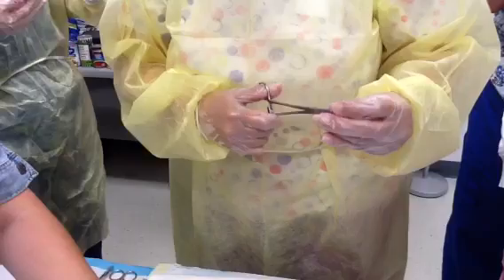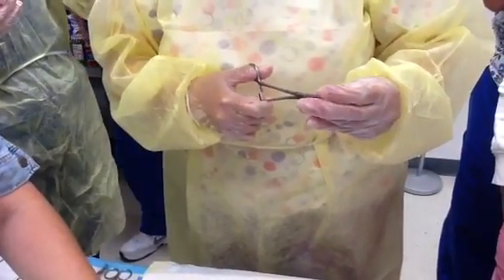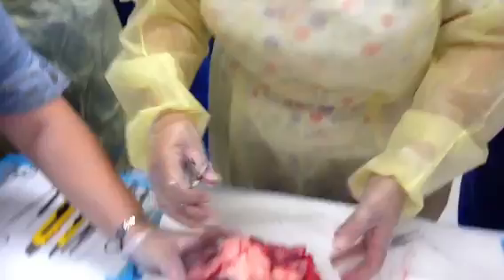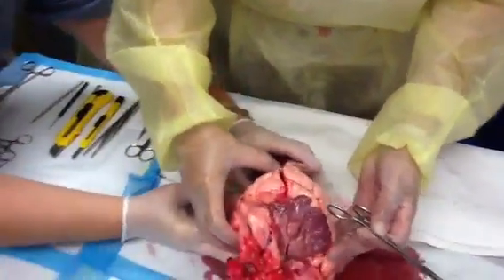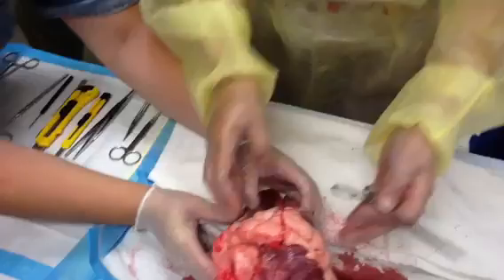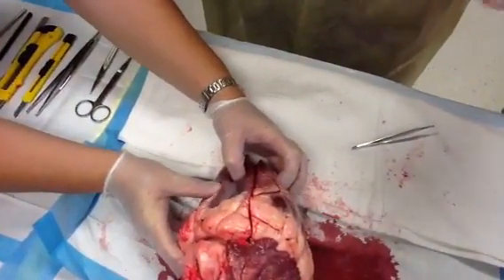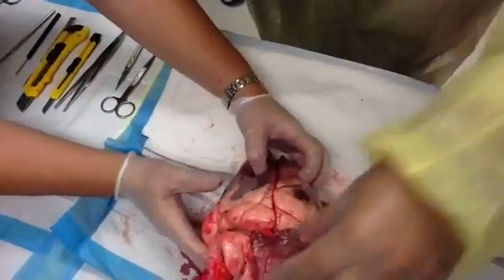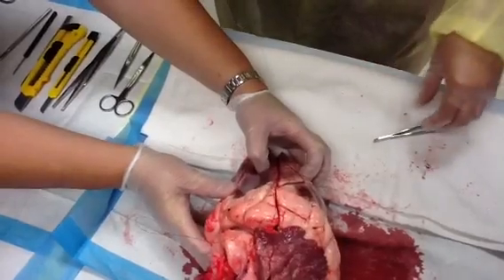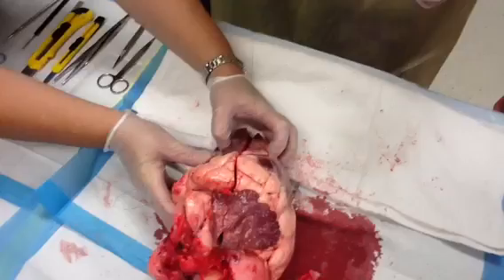I'm just going to do a basic closure here. The needle is kind of small so it may be tough to do. I'm going to turn him around. You guys will not be suturing as medical assistants; however, you probably will be taking the sutures out. So you will be assisting — I need another pair of hands to assist. Come on this side for me, because you're going to hold the suture.